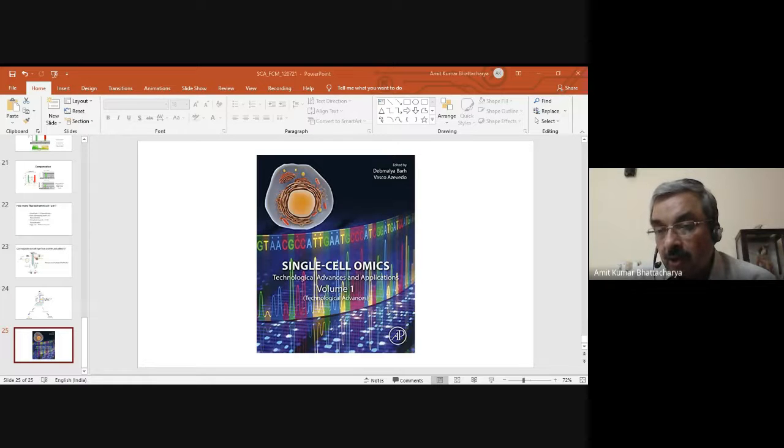Now let's say you're using a tissue in which there is autofluorescence, and you're using 2 dyes, and let's assume these 2 dyes also overlap a little, and the autofluorescence in the background is present across a wide range of wavelengths. It is anyway overlapping with both the dyes.